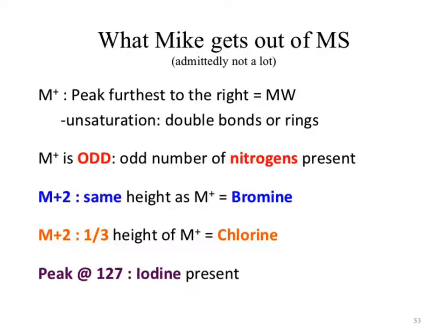So if I looked at the mass, I would only expect to see a contribution from hydrogen, not deuterium. Bromine's a bit odd, because if I look at bromine, it turns out bromine has 2 very common isotopes, 79 and 81. Even though when we look at the mass of bromine, it's 79.9. Because if I average 79 and 81, guess what I get? Darn close to 80. Those two isotopes are found in all bromine, which means if I have a compound that has bromine in it, half of those bromine atoms will have a mass of 79, the other half will have a mass of 81. That's why I see a second peak.